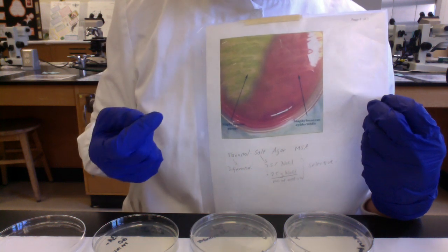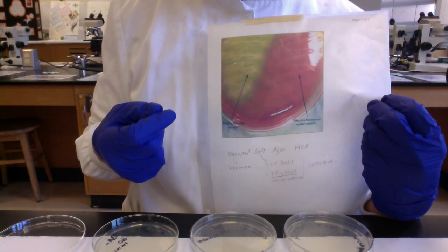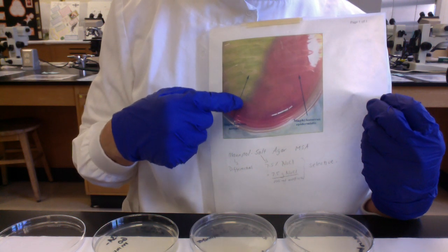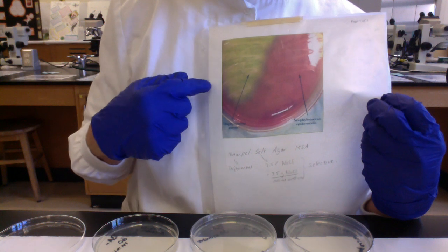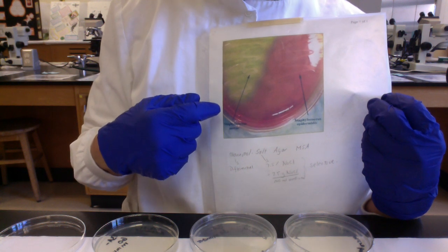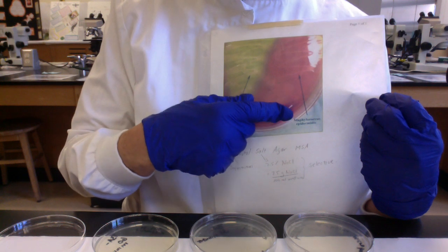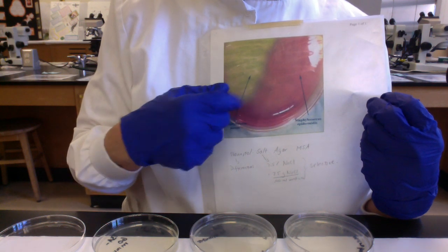So the key here is knowing that Staphylococcus aureus can ferment mannitol, so growing on MSA, it's going to turn the medium yellow. Staphylococcus epidermidis cannot ferment mannitol, so when we grow it on MSA, we're going to have this nice red color indicating that no mannitol was fermented.